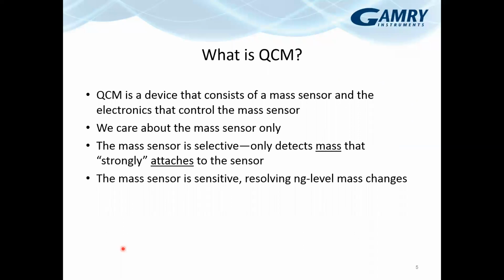We'll start. What is QCM? Well, if you've never heard of QCM before this webinar, that's okay. QCM is simply a device that consists of a mass sensor and the electronics that control that mass sensor.